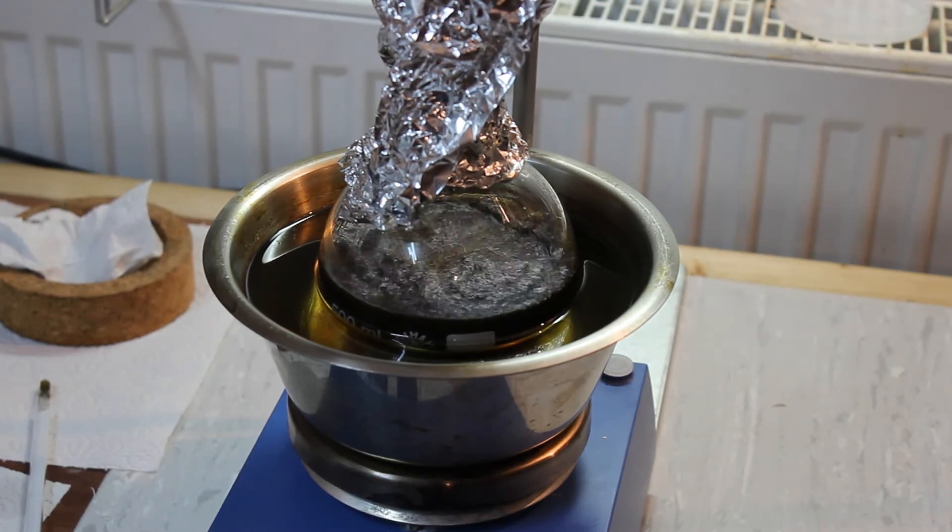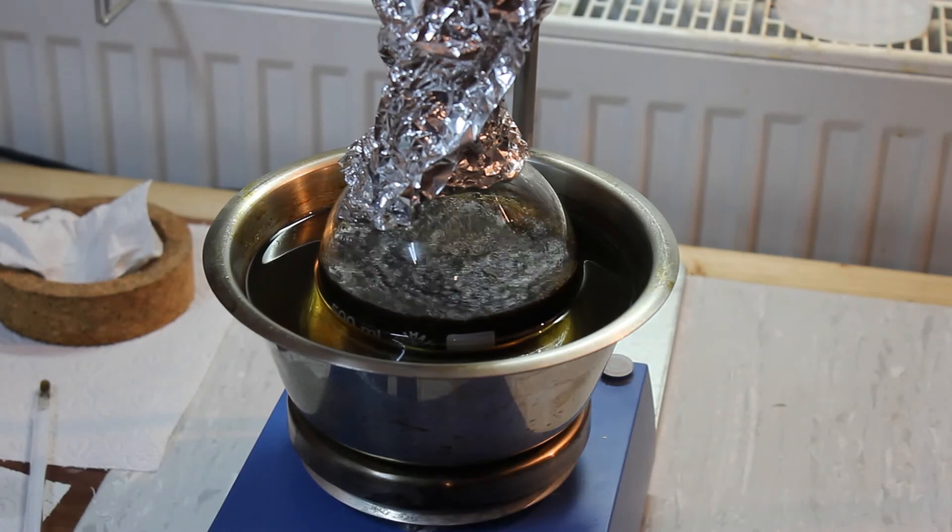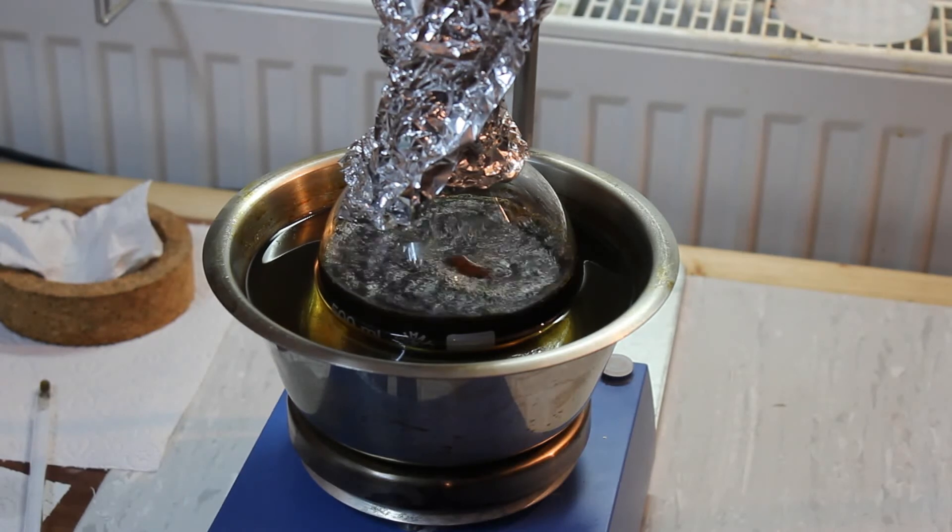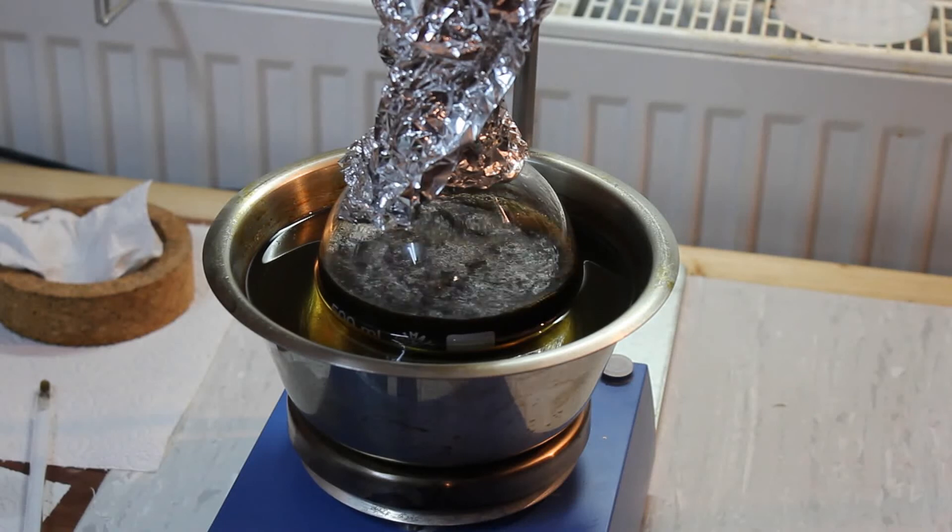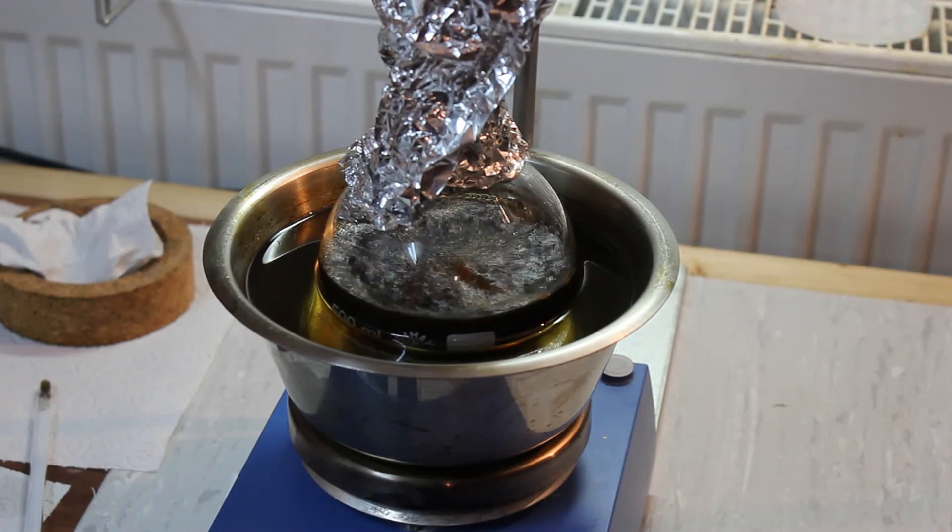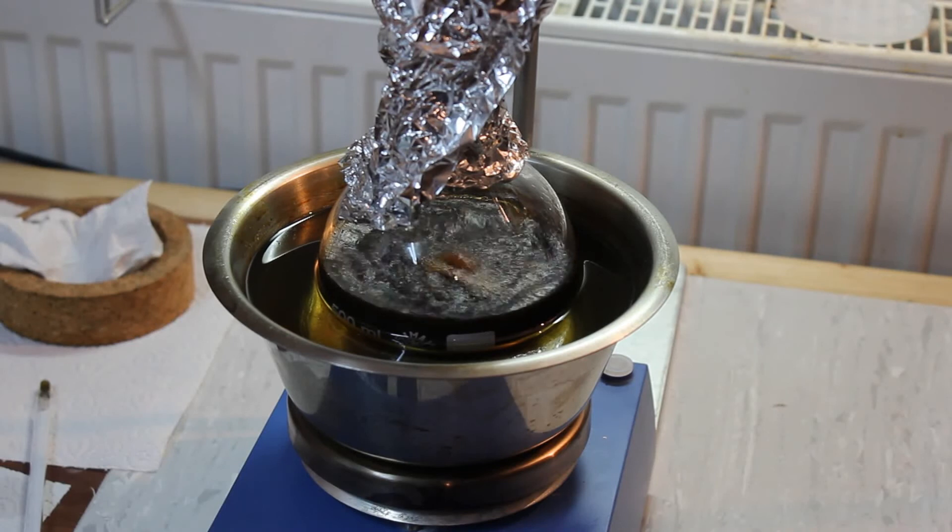The contents of the reaction flask have turned black and this is due to some side reactions. Sulfuric acid is a strong oxidizing acid. So it oxidizes something and it forms essentially carbon. So that's what you see here.